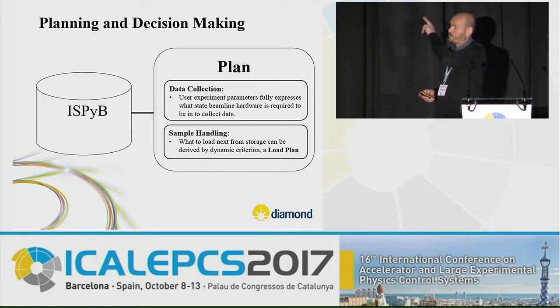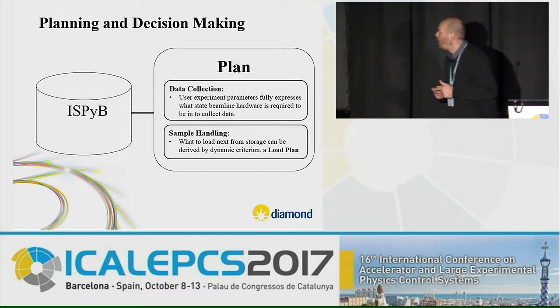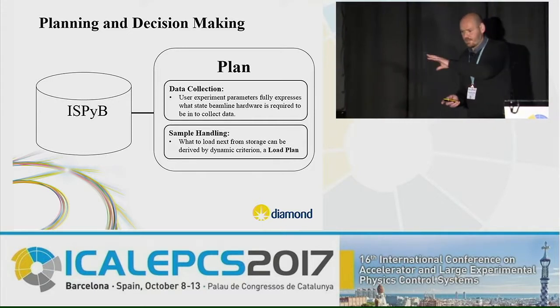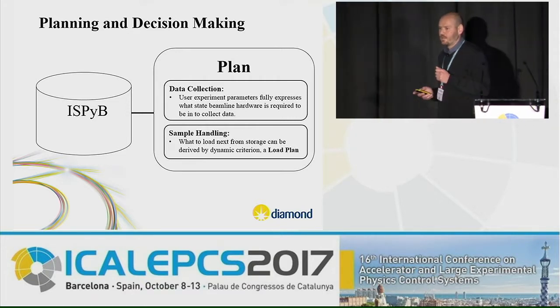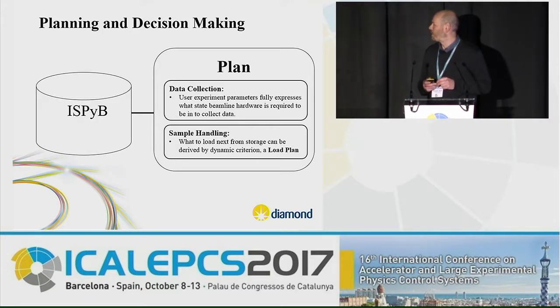So that's great. That tells us exactly how the Beamline should set up for data collection. Now the other issue is we have all these plates in the storage units. How do we select just one of these plates to be loaded onto the local storage area? This is quite a computationally complicated task.